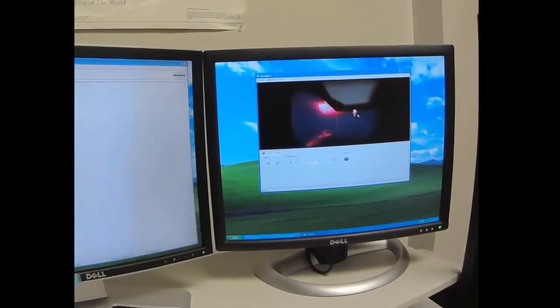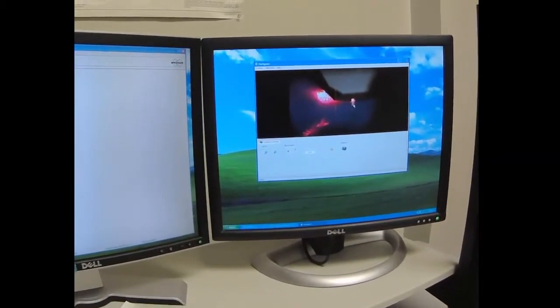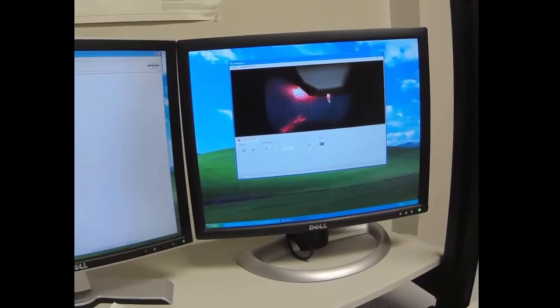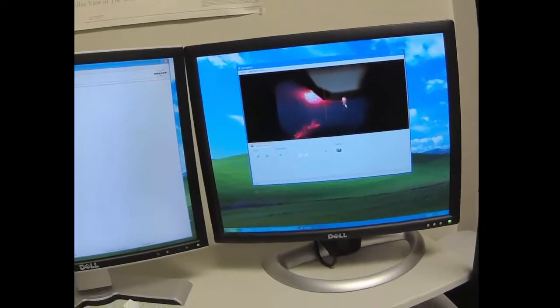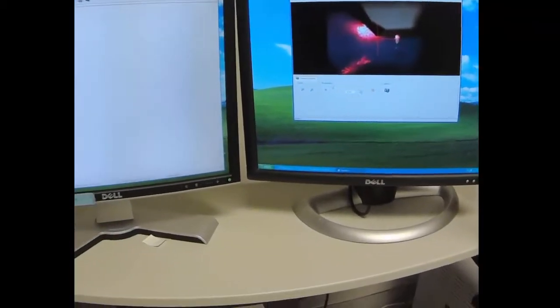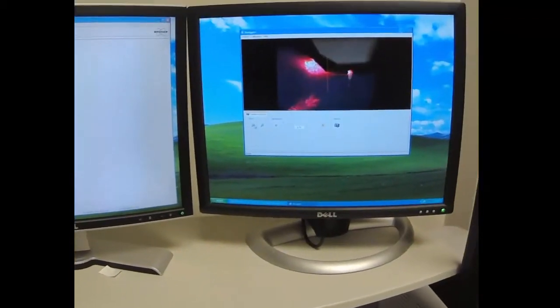And there we go. Now I'm hitting the back of the cantilever. And I want to hit the back of the cantilever near the tip because that will be the most sensitive part. It's like a diving board. Now that I know where this is, I can zoom in.